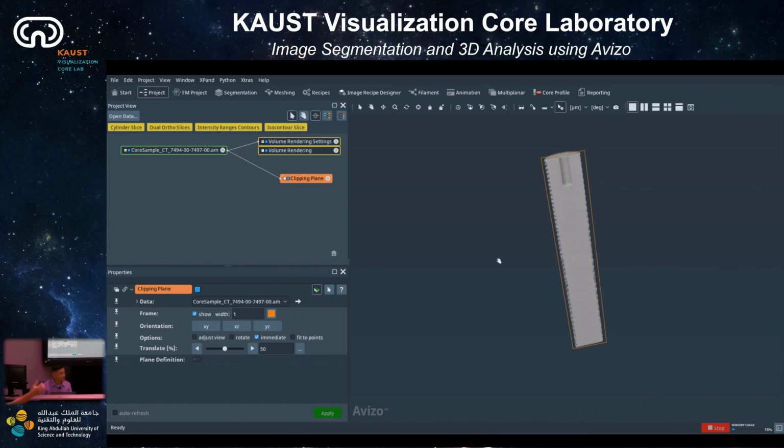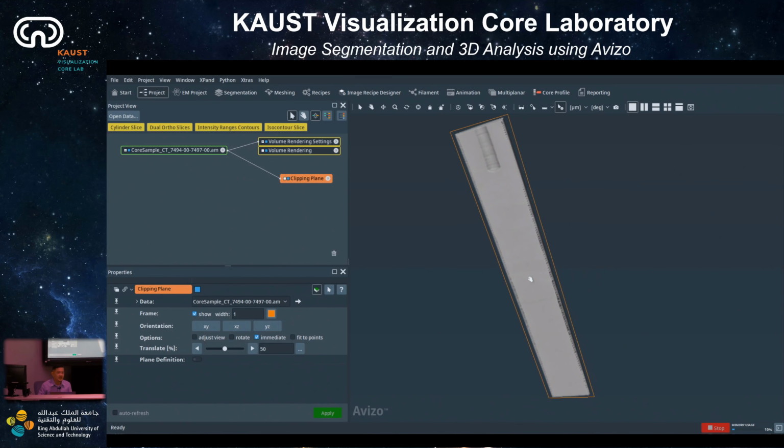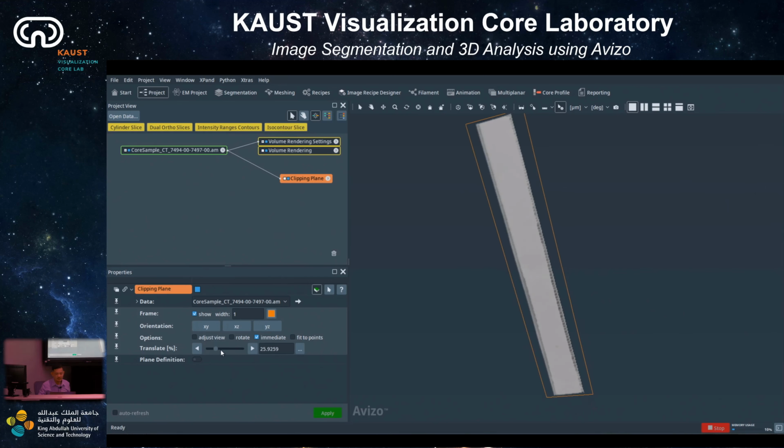So now when you clip, you can see this 3D clipping, and you can always translate the clipping direction or change the clipping direction to clip that. You can also do it with auto slice overlay, but here it's only clipping. There, you can see that it just cuts through the object, to show you another possibility.